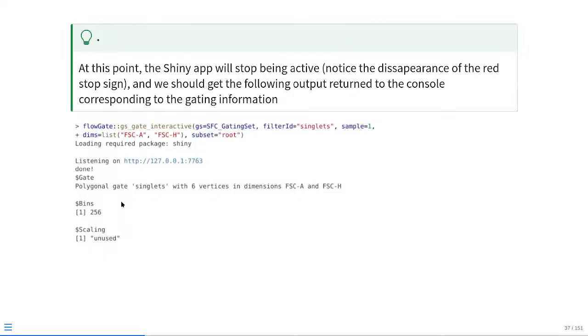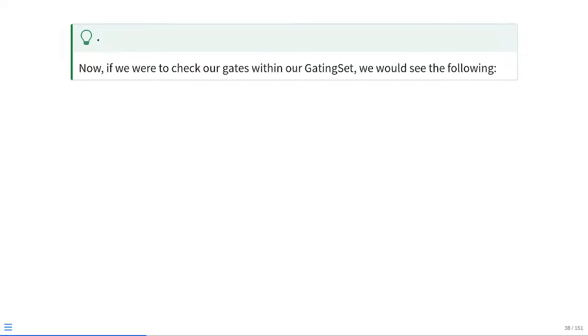So this information is being passed to your gating set, providing the information as far as the coordinates of where to place the particular gate on which particular dimensions. So rather than you having to specify, I want to place my first point here, here, here, here, it's doing all that monotonous kind of work for you and just passing it directly to the gating set. Now, let's go ahead and make sure that it did actually correctly save, because occasionally a bug can happen.